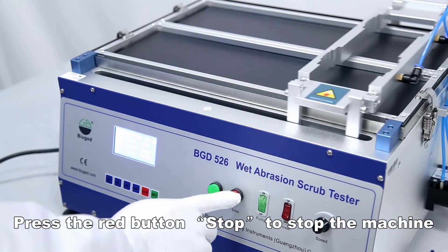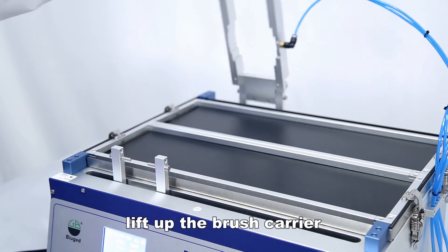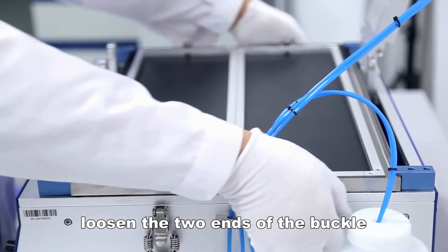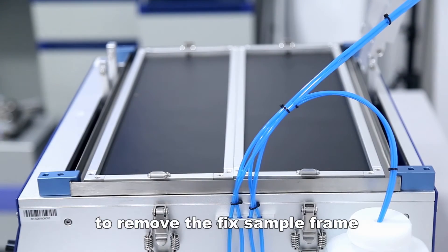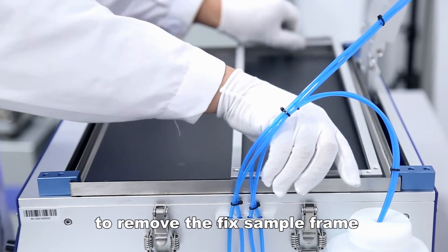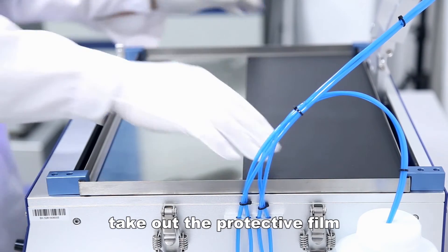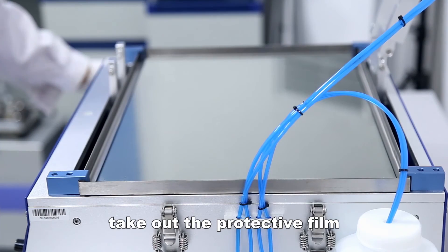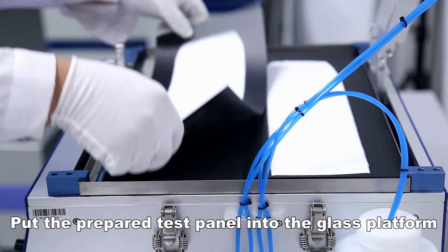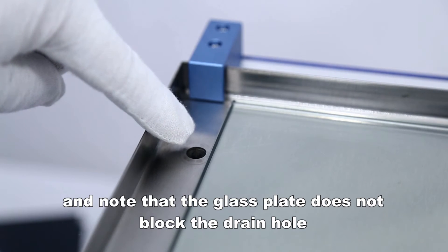Press the red button to stop the machine. Lift up the brush carrier and loosen the two ends of the buckle to remove the fixed sample frame. Take out the protective film. Put the prepared test panel into the glass platform, and note that the glass plate does not block the drain hole.